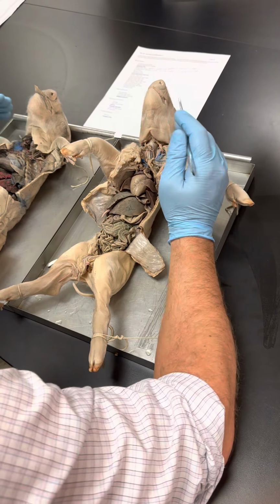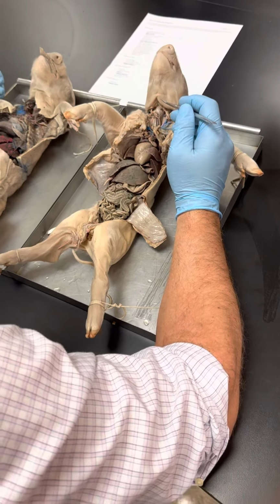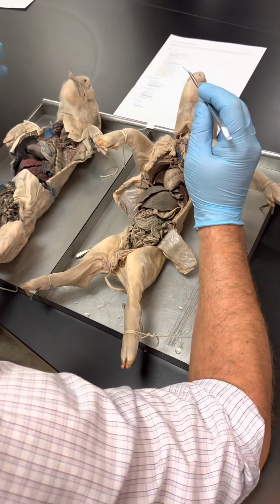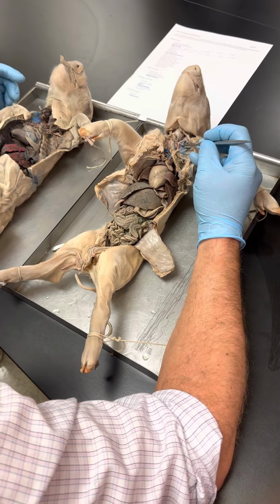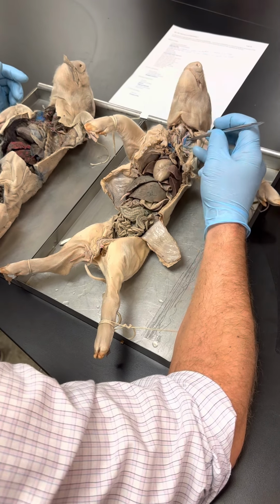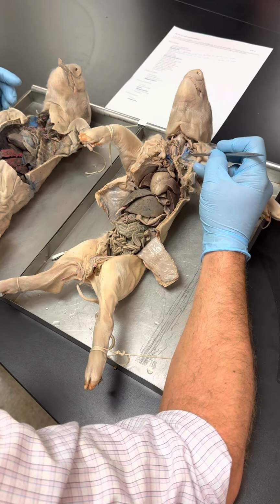Good evening, everybody. Welcome to the Fetal Pig video. All right, first structure on the script that I have to stick to. First one is common carotid artery. Here's our common carotid. So I'm only going to show it to you on this pig. After common carotid, we have our internal jugular and our external jugular.